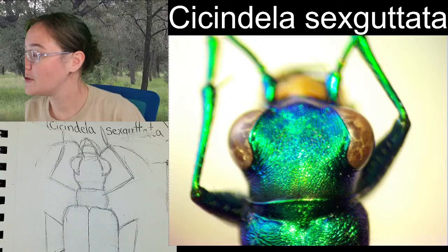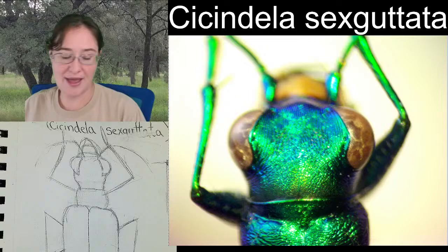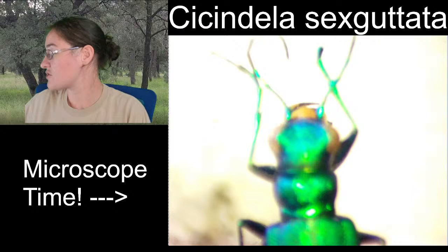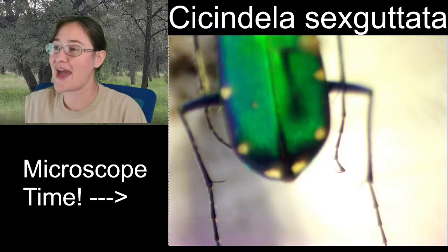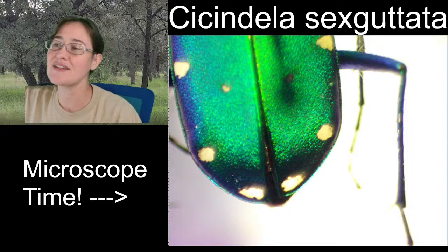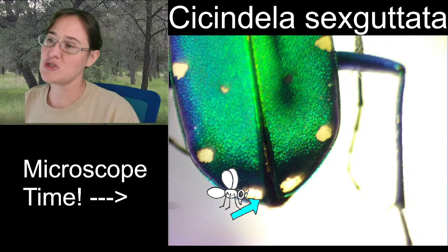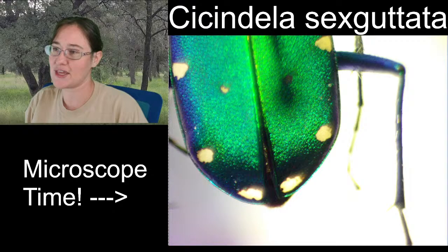All right, before you get onto the head, sorry, at the back end, are the last pair of spots on the elytra, or is the abdomen protruding beyond the elytra? The last spots are on the elytra, and the abdomen is protruding past those. So if we look right here, there are those spots. They are on the elytra. And if I focus it, you see how there's, it's not huge. So actually, I think mine might have been too large. But there's the little tip of the abdomen at the end, right after those spots. It's not huge, but it is noticeable, and I think it is likely going to be one of those characteristics that shows up on a key, as to whether or not the abdomen protrudes from the elytra.